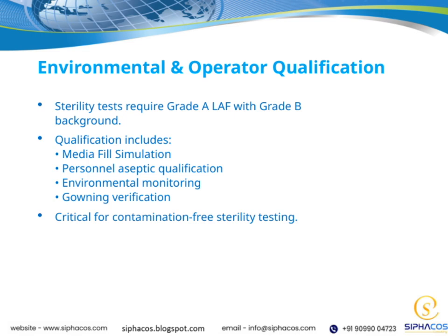techniques are effective. We also have personnel aseptic qualification, which ensures that everyone involved is properly trained and consistently performing the correct aseptic procedures. Environmental monitoring is another key aspect, where we regularly check the environment for any potential contaminants to maintain that sterile condition.